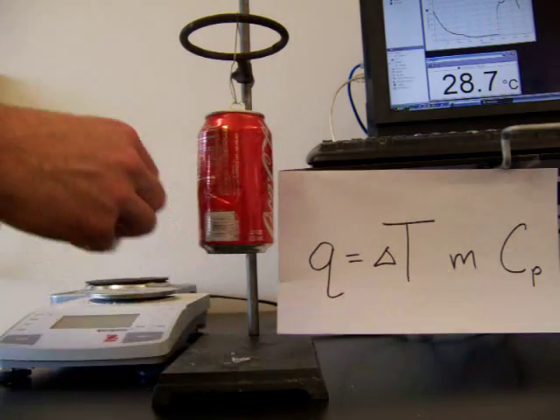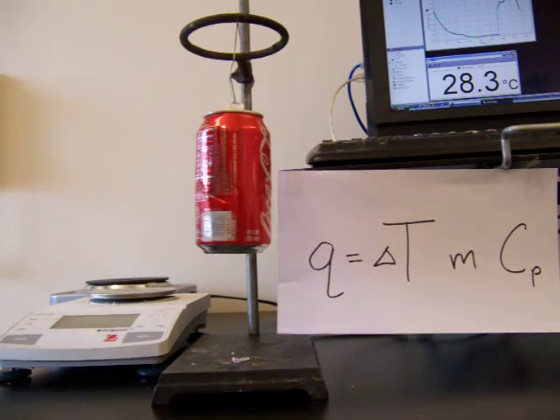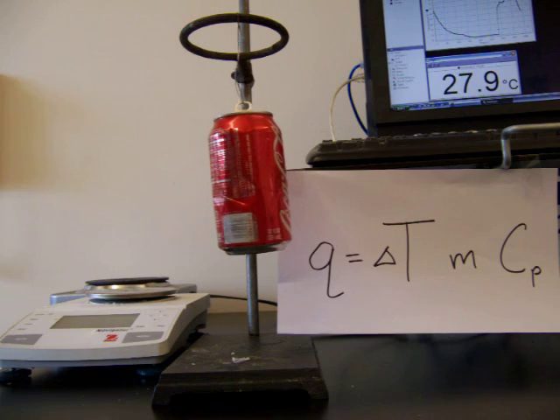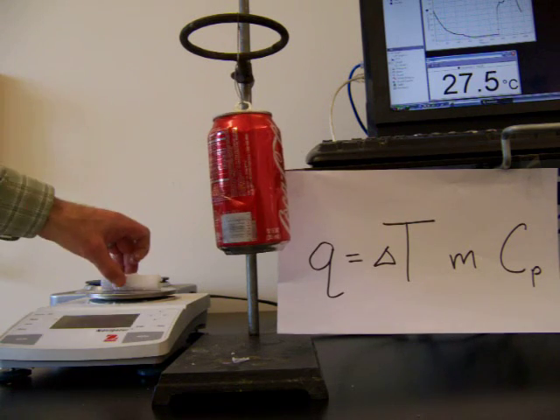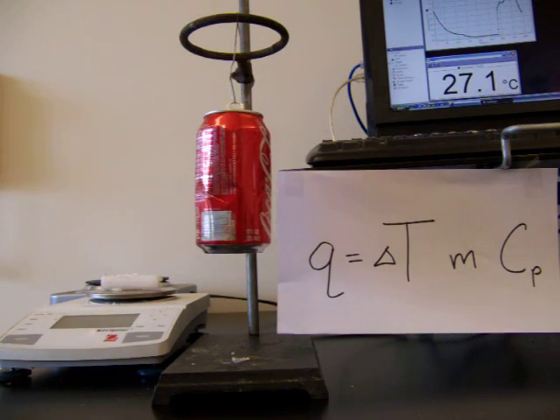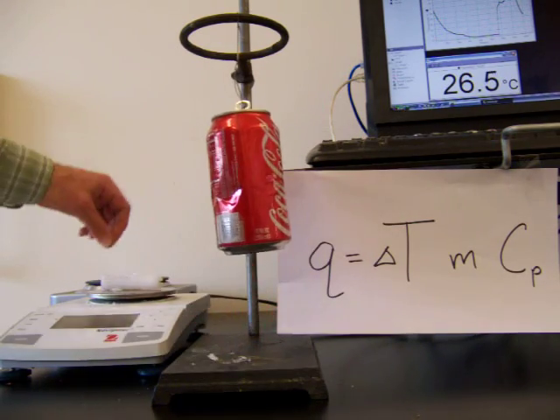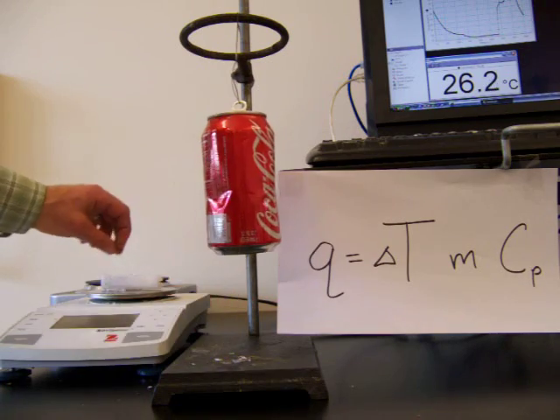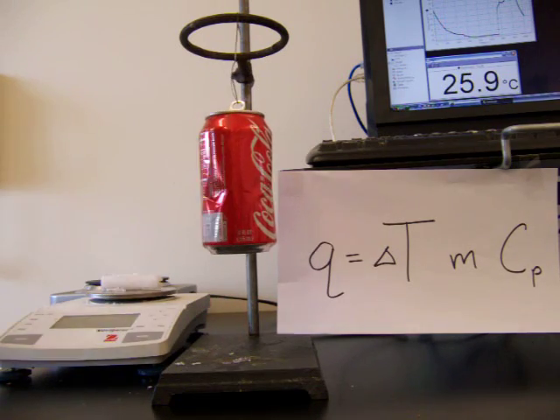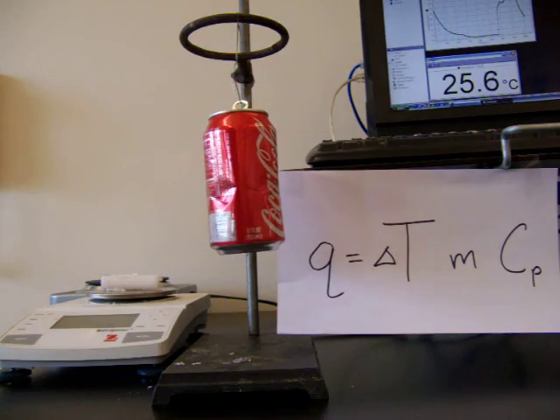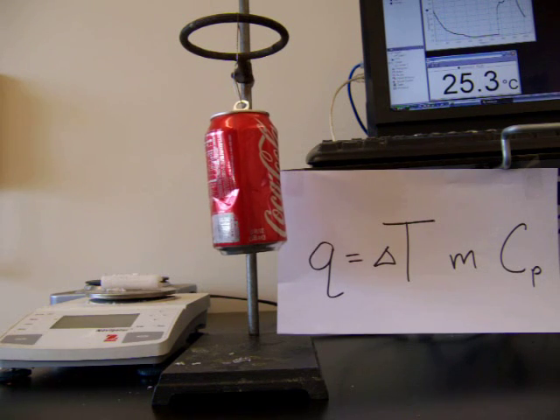This paraffin, we didn't burn the entire candle so we're now going to figure out how much we actually burned. So I'm going to take the candle and set it over here on our balance again. Try to pick up the wax that dripped off as well because this wax didn't actually burn so we'll try to put that on the balance as well. And our final mass of the candle is 21.06.